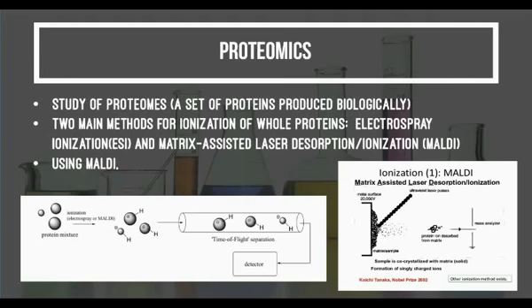The most widely used instrument for peptide mass analysis are the MALDI time of flight, which is the time it takes for the particles to travel a distance through a medium, instruments as they permit the acquisition of peptide mass fingerprints. These peptide masses are measured through the MALDI TOF or ESI TOF. These peptide masses are compared to either a database containing known protein sequences or even the genome.